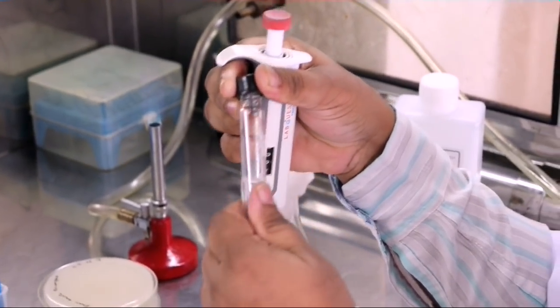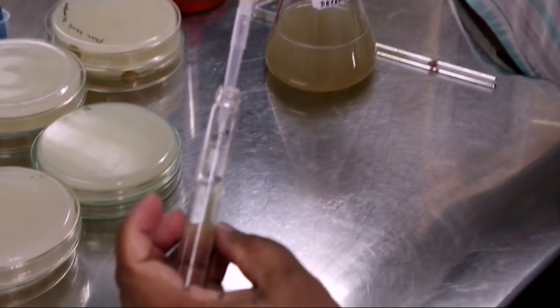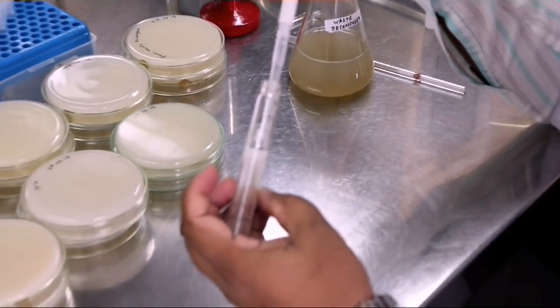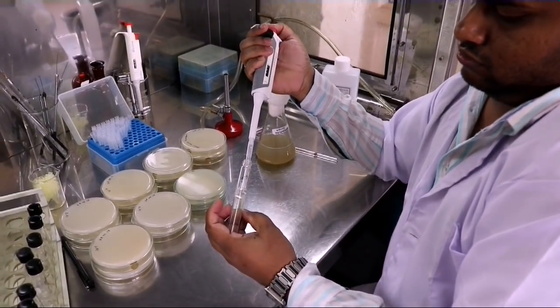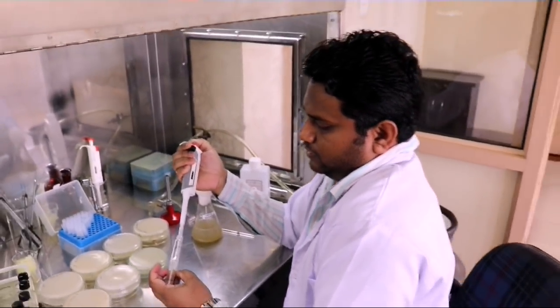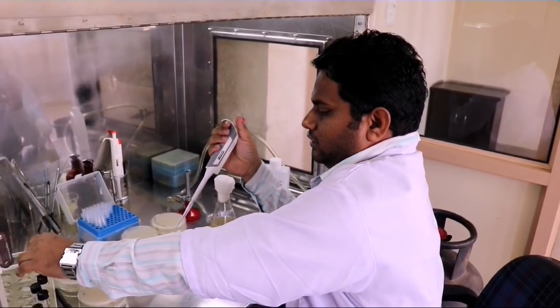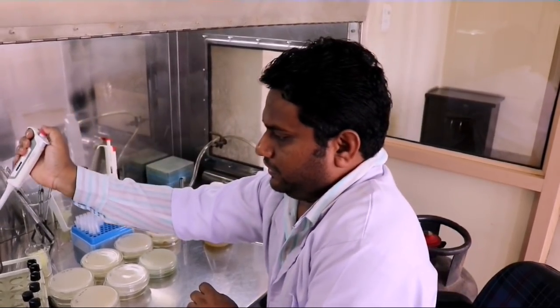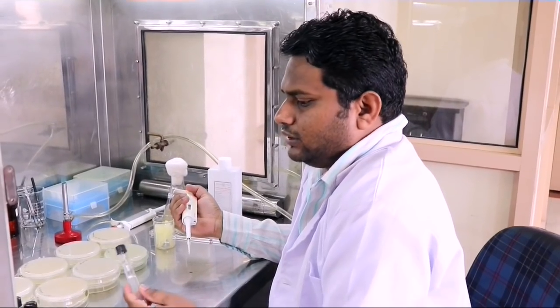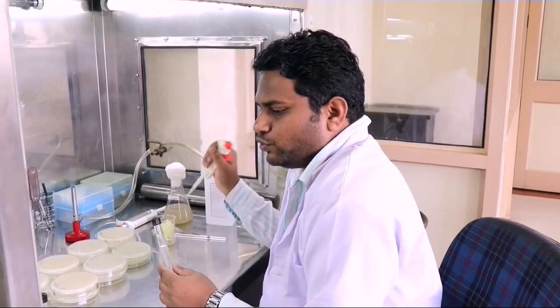Now this is the final dilution, and from the final dilution we pipette out 1 ml which needs to be discarded in order to maintain the initial quantity of 9 ml. We are discarding the pipette also. Just now we have made the serial dilutions from the stock culture — pure waste decomposer culture.